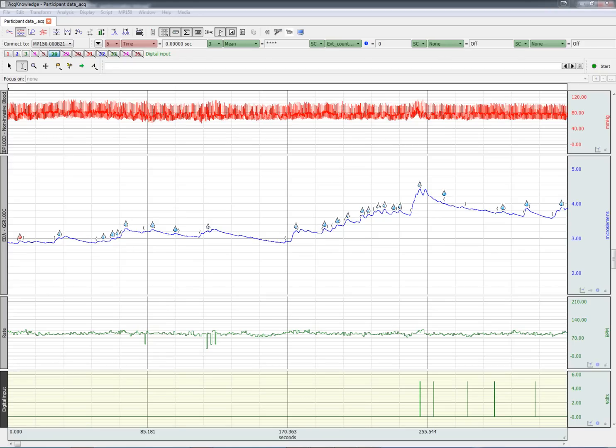Starting with version 4.3 of AcqKnowledge, it's possible to synchronize and merge Biopac physiological data and SMI eye tracking data. The SMI computer parallel port should be connected to Biopac's STP100C.